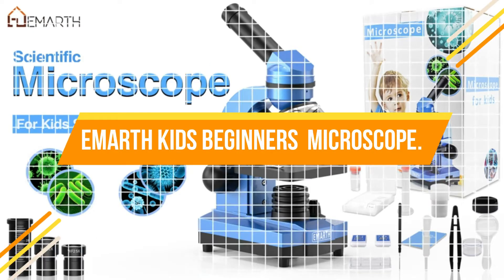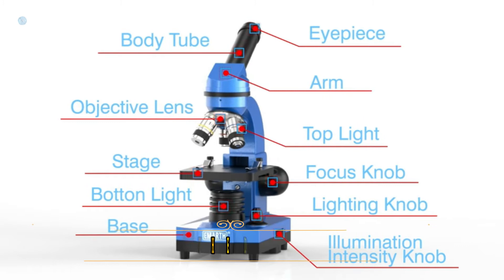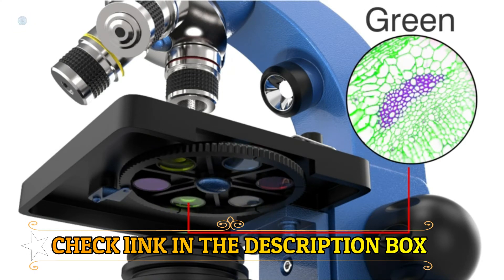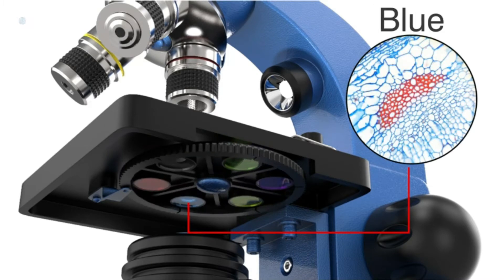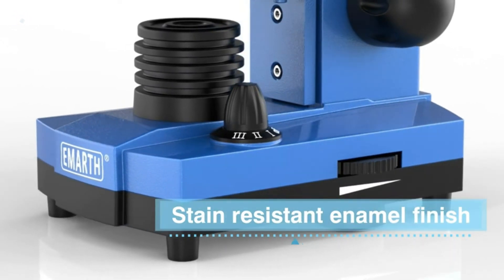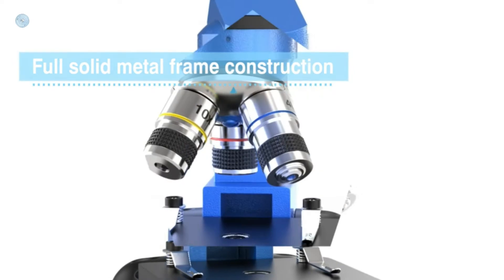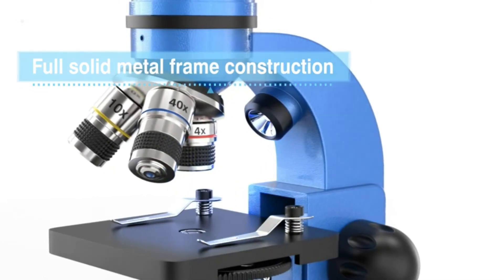Number 4: Amarth Kids Beginner's Microscope. High magnification microscope with built-in WF-10x and WF-25x eyepiece and optical lenses at 4x, 10x, and 40x. The rotatable monocular head offers 6 magnification levels at 40x, 100x, 250x, 400x, and 1000x. High-quality optics give children improved visual quality and sharp images. Dual light illumination: this compound microscope has incident and transmitted light sources, which can see both opaque objects illuminated from above and translucent specimens illuminated from below. The bottom light can be adjusted by rotating the wheel as needed. Easy to use; batteries not included.